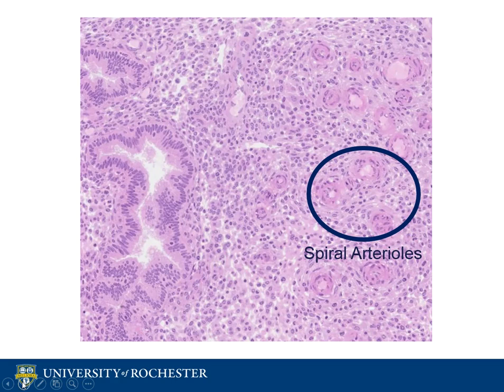In the secretory phase, the glands take on a corkscrew shape and actually fill with glycogen, and we also see changes in the stroma. To the right, you may notice these spiral-looking figures, which are actually called spiral arterioles. These small arteries supply blood to the endometrium and become much more prominent in the secretory phase.